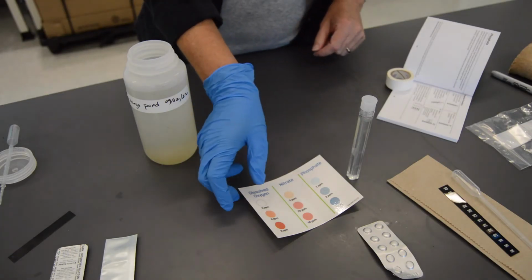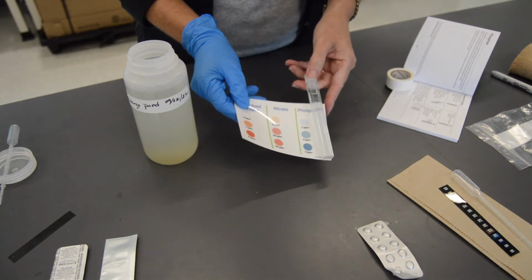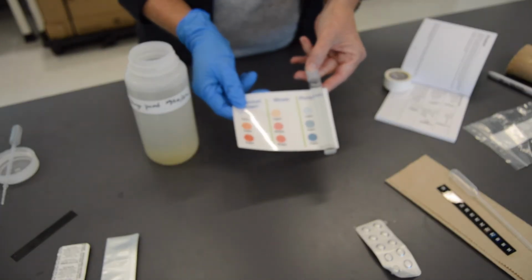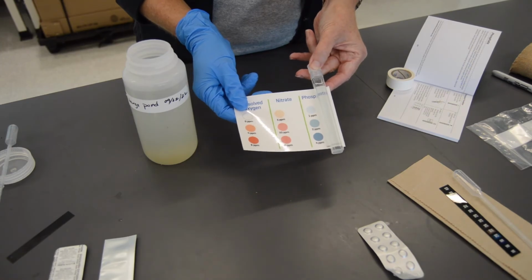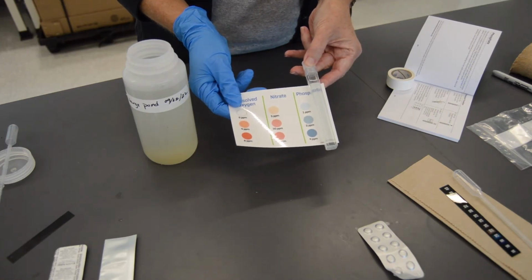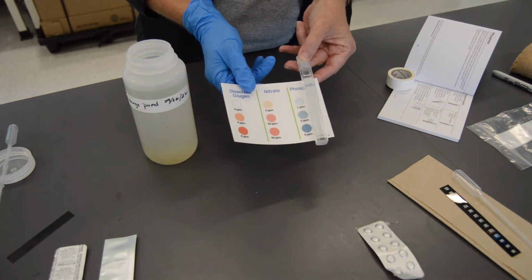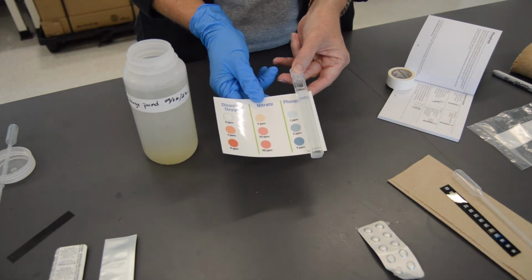All right, so we've let our color develop for our phosphate test. And so when we compare to the chart, we are down around 1 ppm or less, which is where we want to be. That's an excellent level. Once we start getting up above 2 ppm toward 4, we're starting to get to the point that the nutrients are too high and your area is at risk of eutrophication.